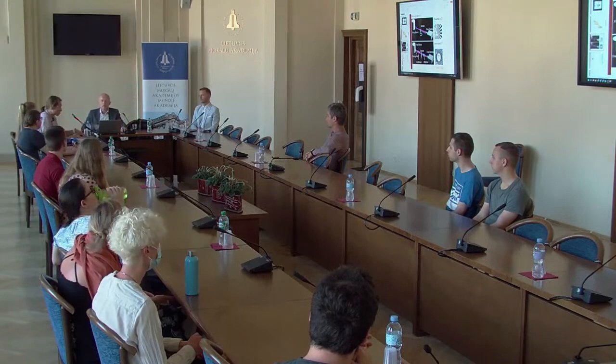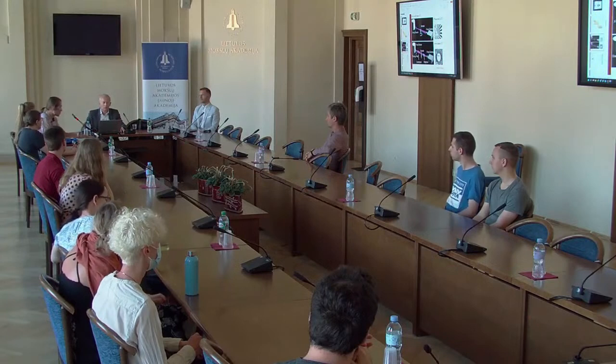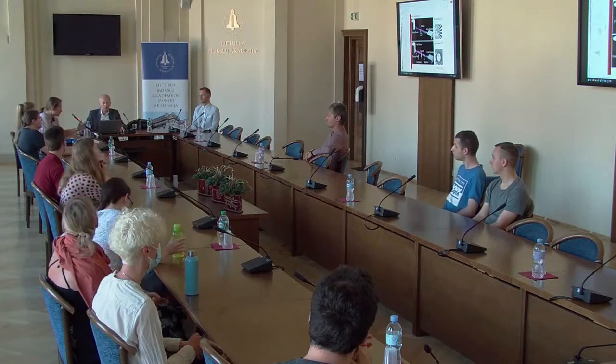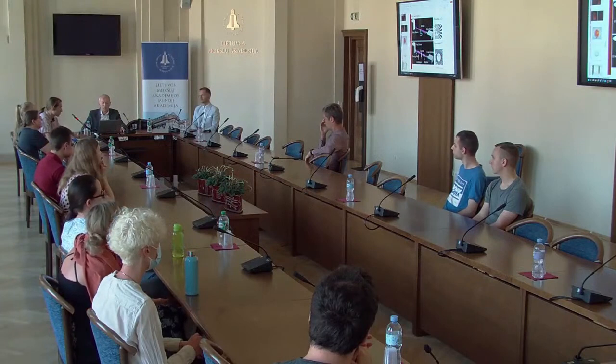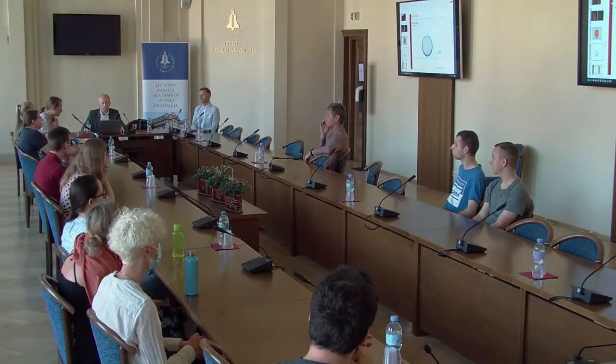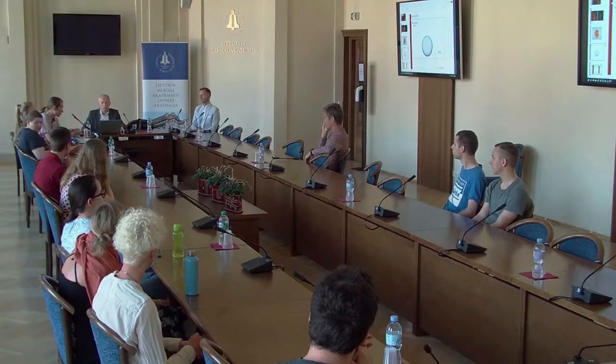Sakykime, jeigu šitas tiesiog nesimato, bet kaip buvo lydyto stiklo gabaliukai, ar galima turėti bandinio laikiklį ar tą terpę, kuri būtų kaitinama arba šaldoma, sakykime, iki šimtų laipsnių, kad tą patį burbuliavimąsi arba susilydimą stebėti?